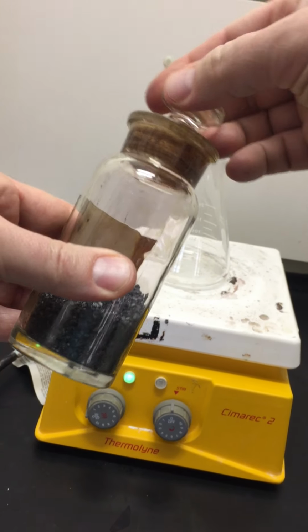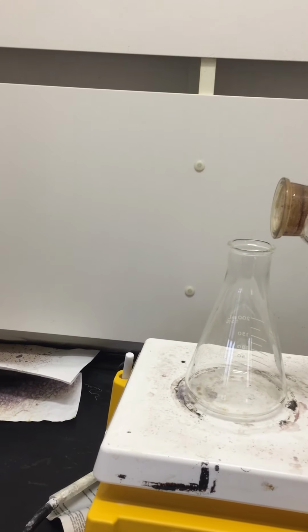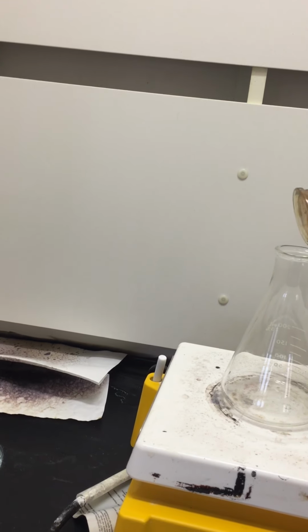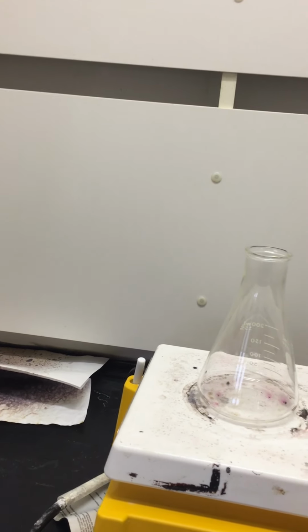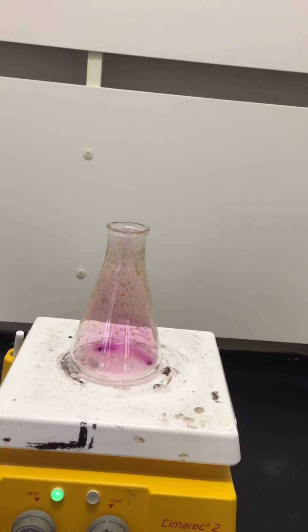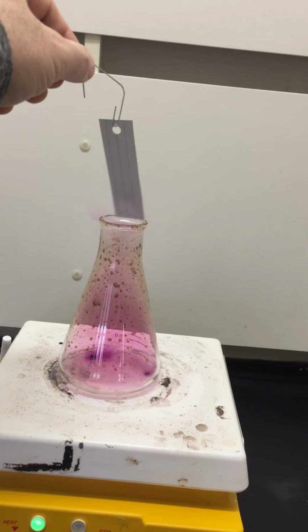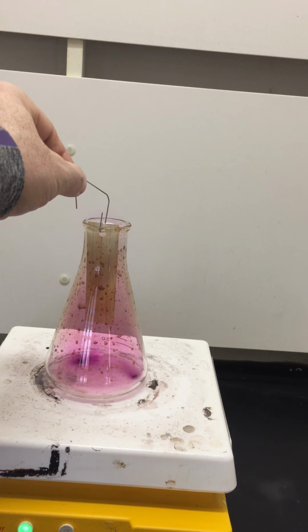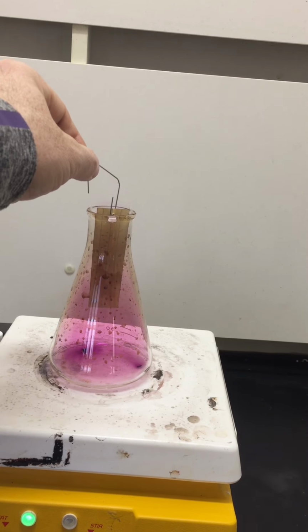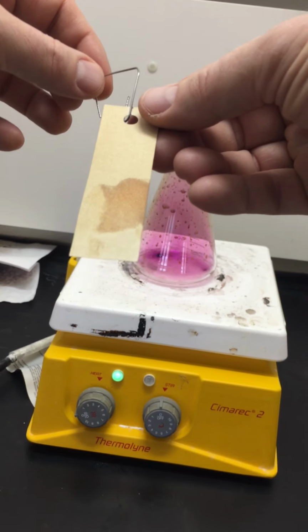Iodine is a solid at room temperature. I'm going to drop a couple of crystals in there. I've got the heat on. It's not going to take more than a couple. You can see it's already subliming. This part is not going to take very long. You're going to see how quickly it develops. Don't leave it in there too long. That'll probably do it. Okay.